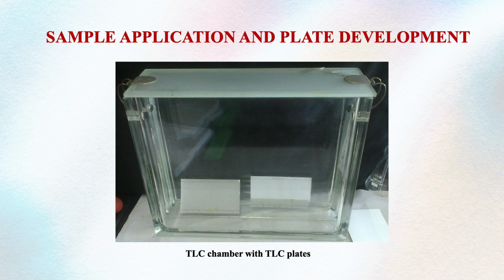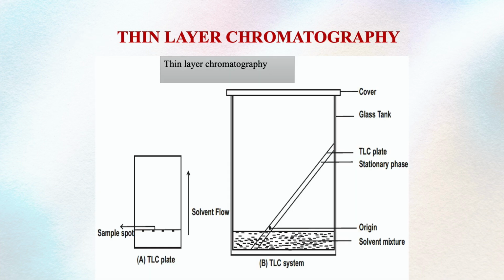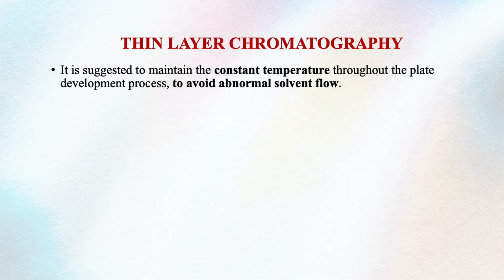Sample will also move further. This is how the entire TLC setup looks. This sketch also explains how to load the sample, where the sample spot is, and how to run the TLC system.